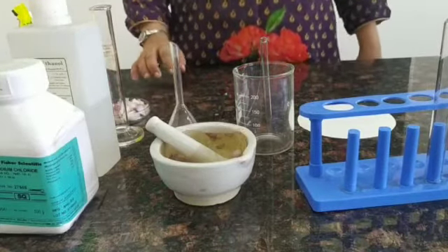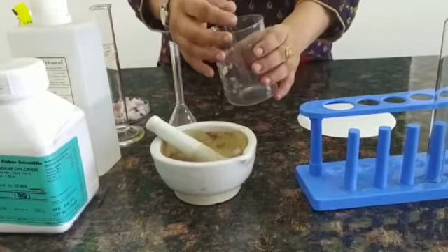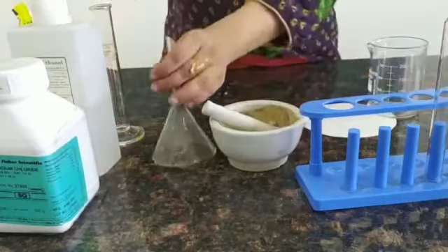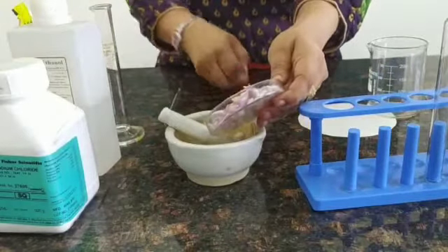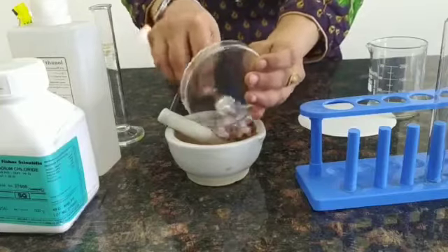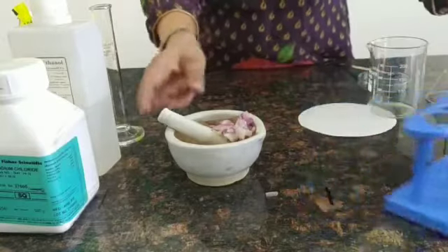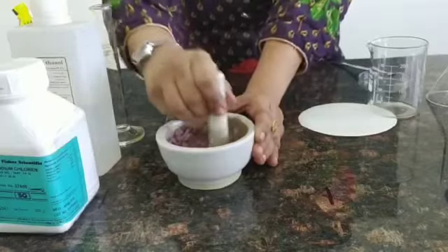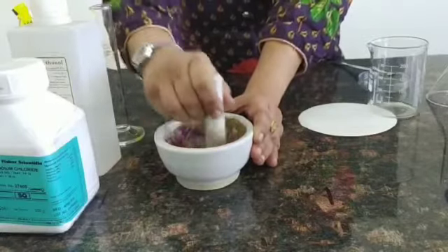The very first step is blending. We are going to blend the onion to a paste. The purpose of the blending process is that it degrades the cell walls and membranes, permitting the release of DNA. We don't have to blend it for too long as it will break up the DNA fibers.